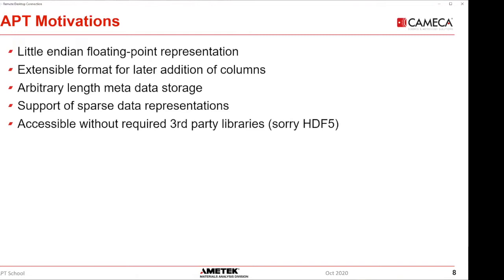And then also with APT, I wanted to make sure, when I wrote this new file format, that you didn't require any third-party libraries to read or write it. I looked really strongly at HDF5, based on Marcus's and other people's recommendations, and found that in the end it was kind of a heavyweight library to drag around anytime you wanted to write a really simple script to read or write a file.